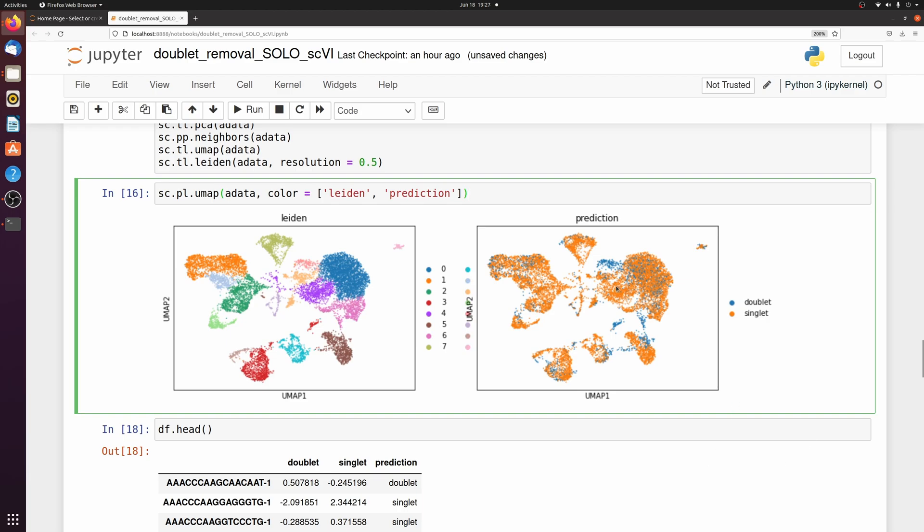That was really simple. We only wrote a couple lines of code and it really improves the quality of your downstream single cell analysis.